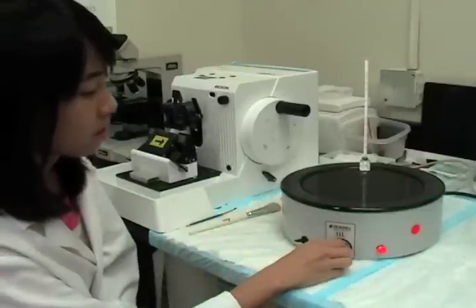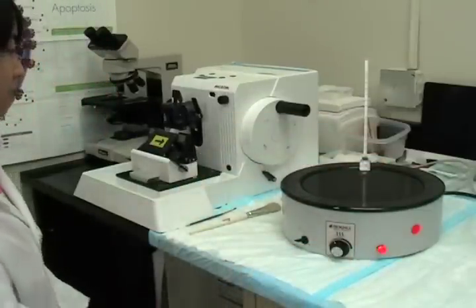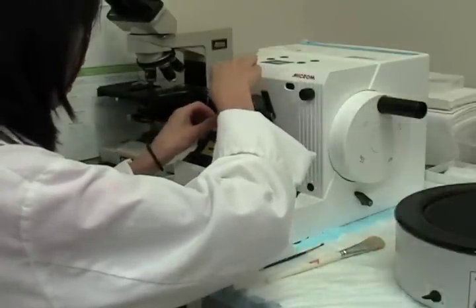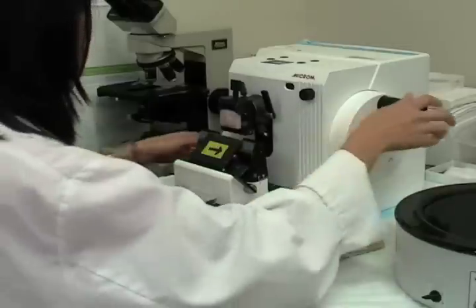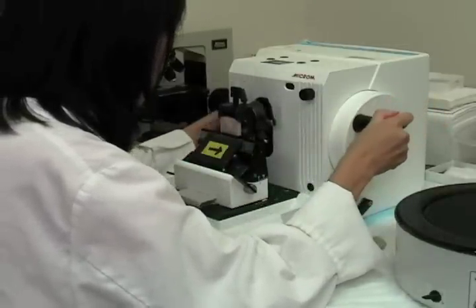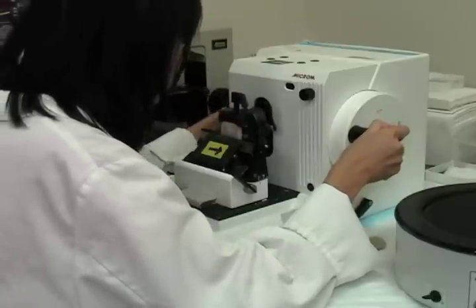First, you turn on the water bath so it can warm up. You then put a paraffin block onto the clamp and unlock the microtome. Adjust the distance between the paraffin block and the blade so that it is close but not touching.